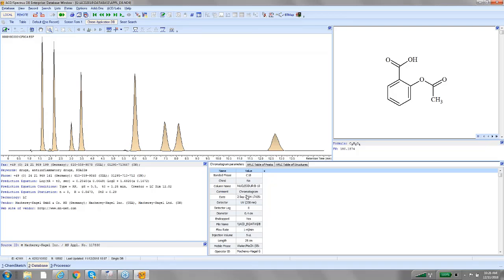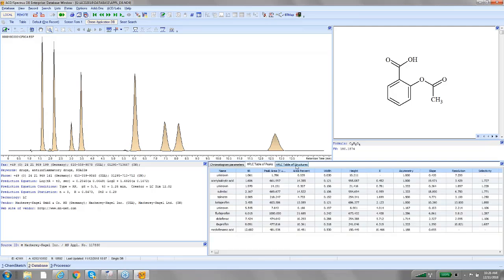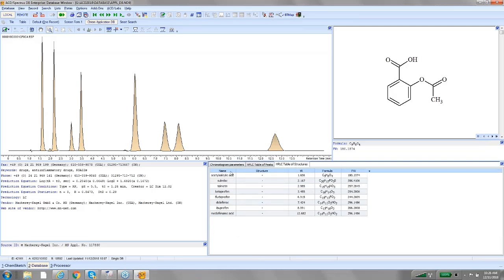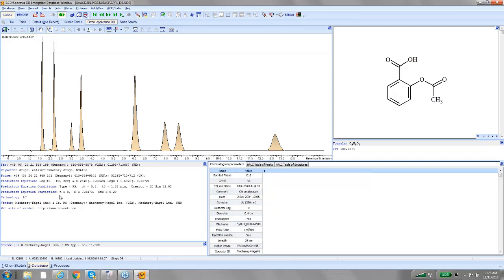So you'll notice everything from the method came into the database. So all the chromatographic parameters are here, all the tables of peaks, and structures. You don't have to have structures.